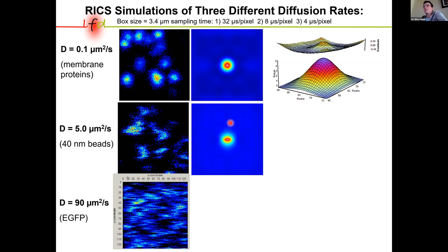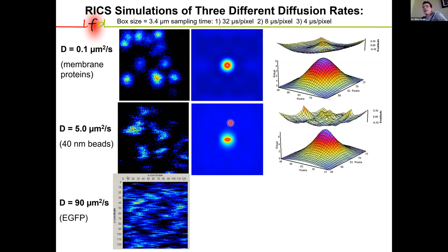But at the same time, because it takes quite long to complete the scan of the entire line and go back to the next line, the molecule most likely is already gone by the time you arrive at the next line, and this is why you have a compression in the y direction of the function.